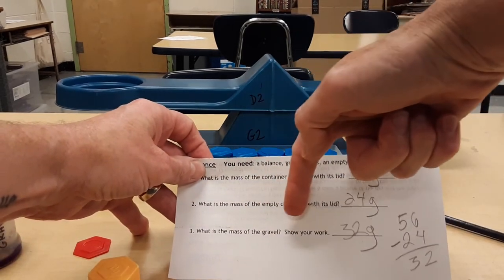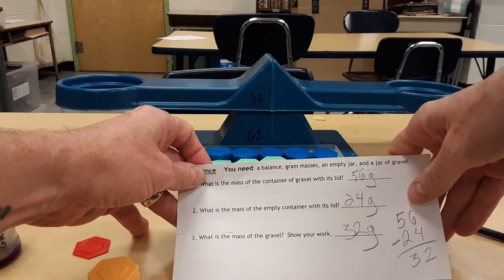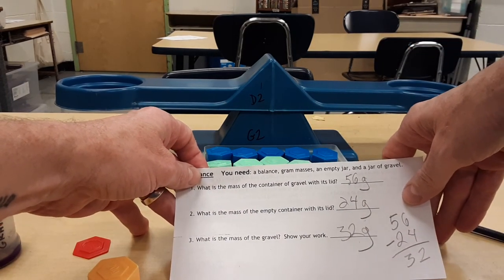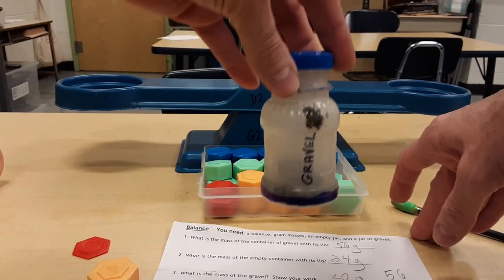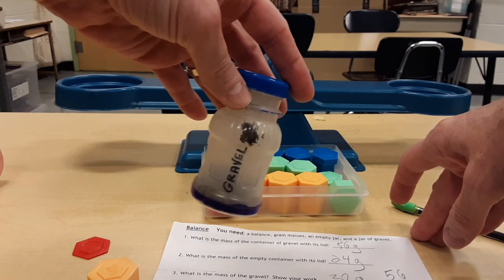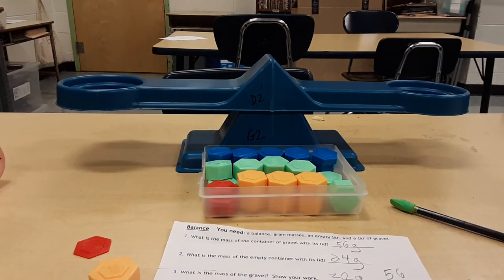What is the mass of gravel? The answer is 32 grams. And that, my friends, is how you use the balance to find the mass of something in a container without having to take it out of the container. The end.